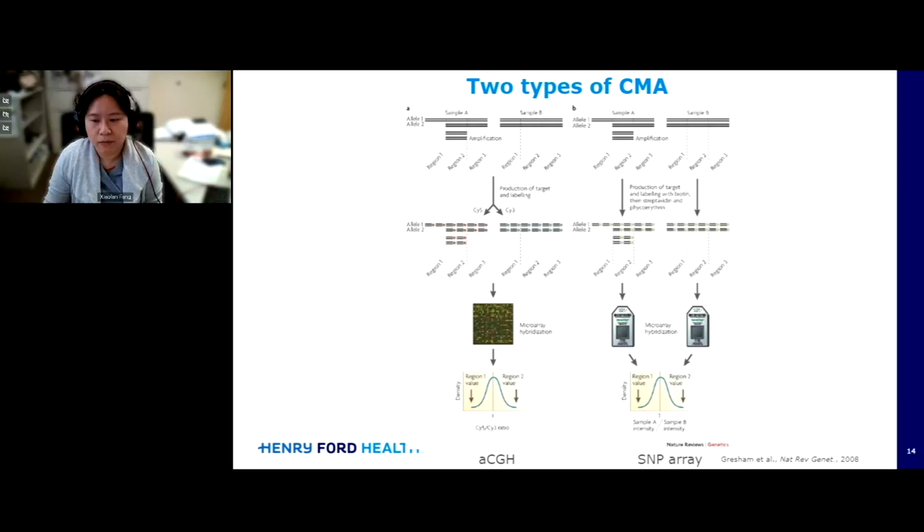At most probes, equal amounts of the two samples will hybridize, yielding yellow features on the array, reflecting the fact that most loci in the two genomes are present in equal amounts. Regions that are deleted in the sample genome, for example, region 1 of sample A, will result in probes with increased relative Cy3 signal at the screen features here.